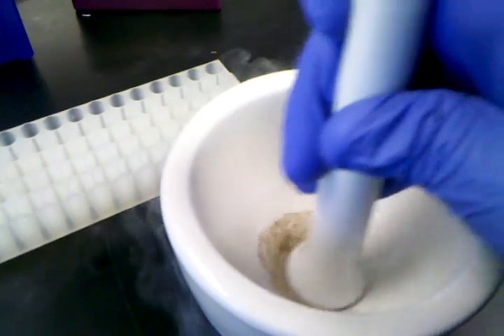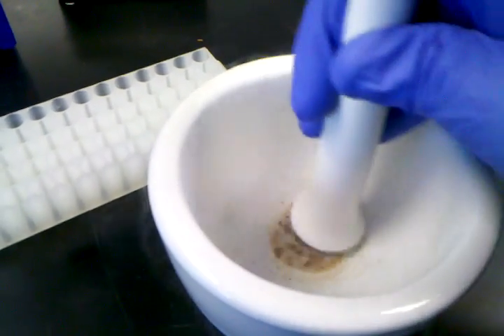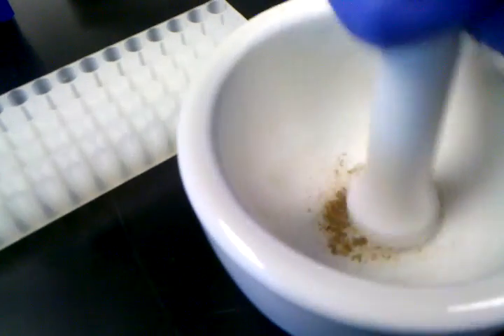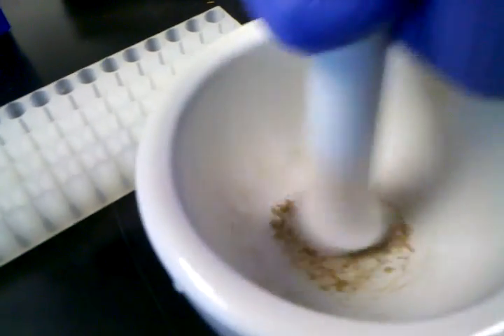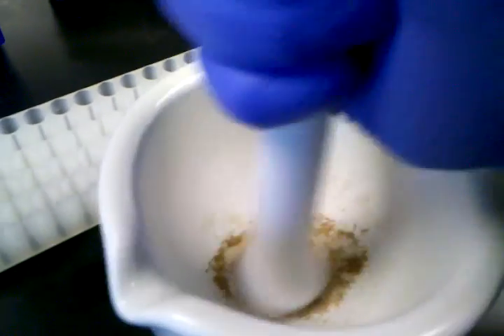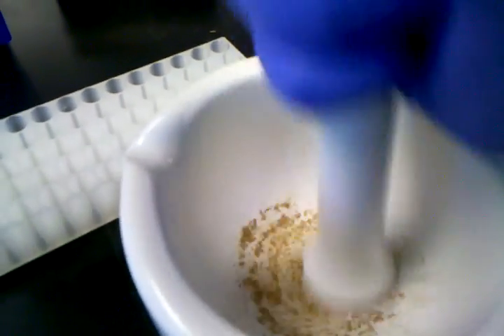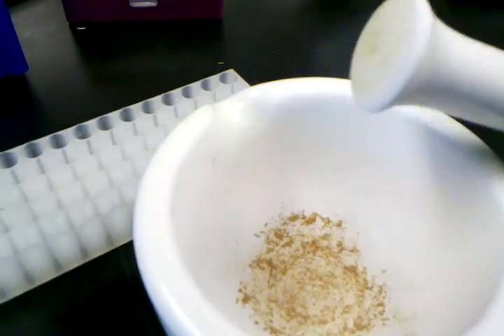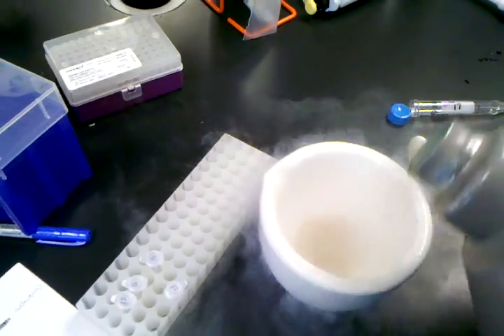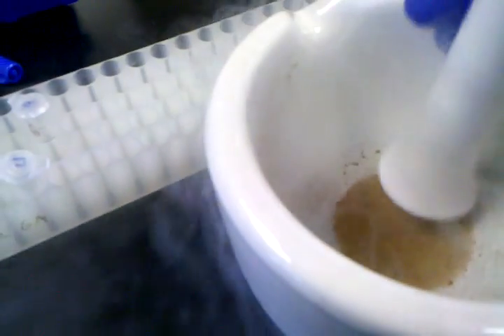The liquid nitrogen is starting to boil down completely. When you're left with this, go into the final stages of grinding. Knock off your pestle and pour in some more liquid nitrogen. This allows the tissue to be collected down at the bottom and further ground into a powder.